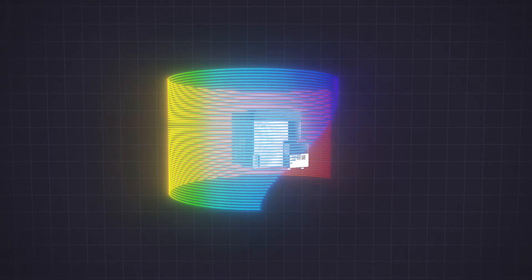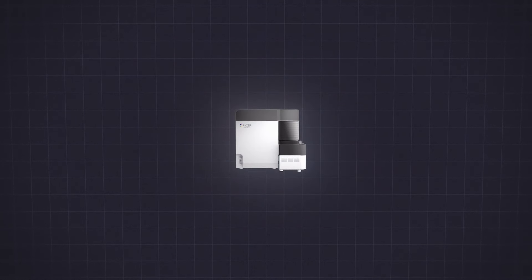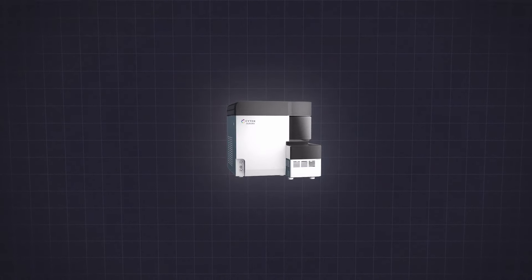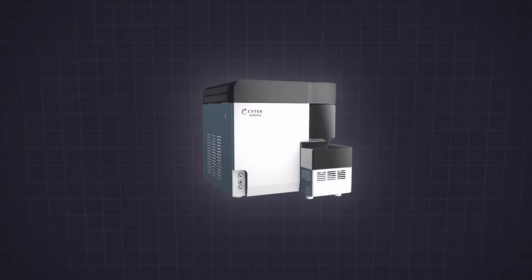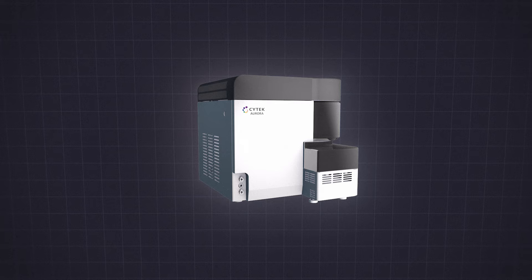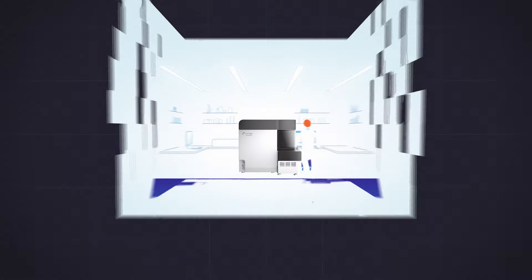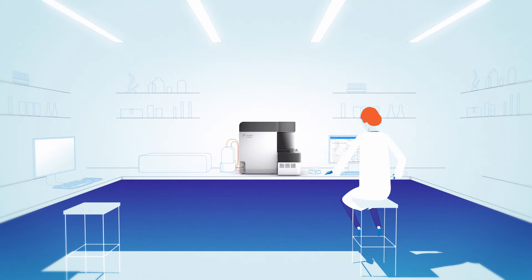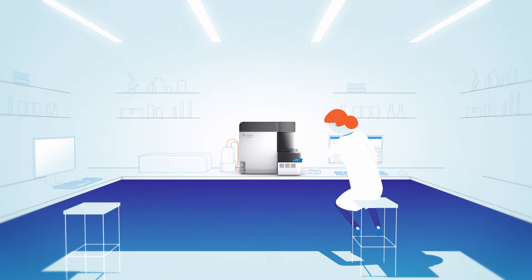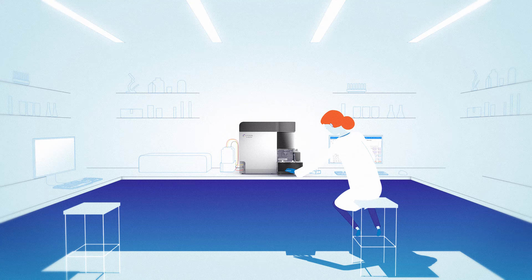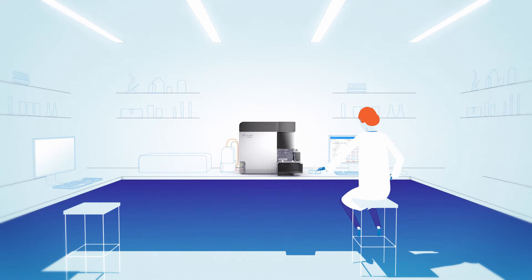The Cytec Aurora is a full-spectrum flow cytometer that is shaping the future of cell analysis. Within its compact size is a lot of flexibility, making the Aurora an easy addition to any lab.